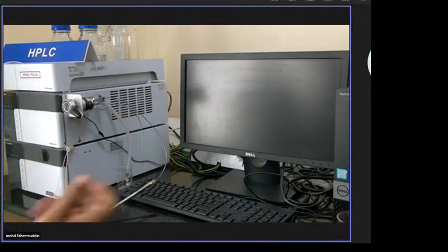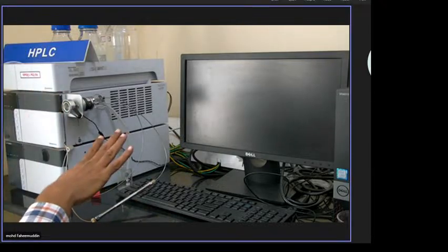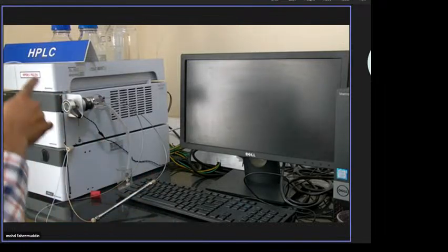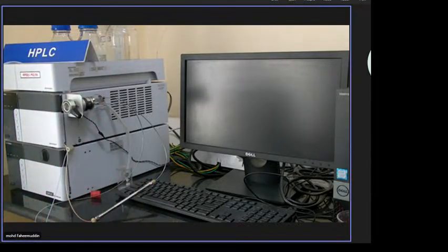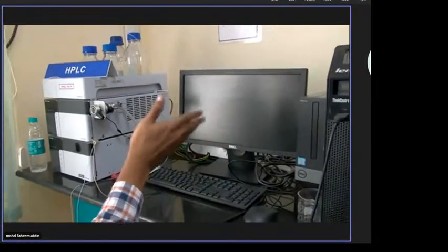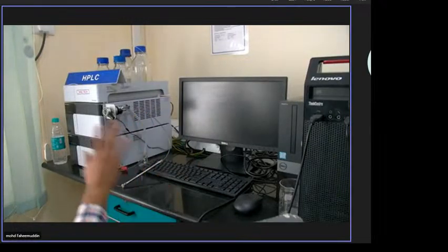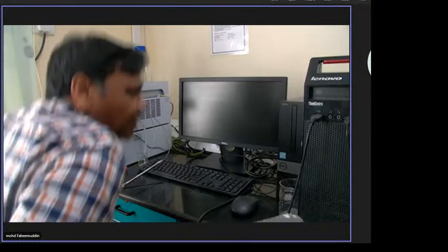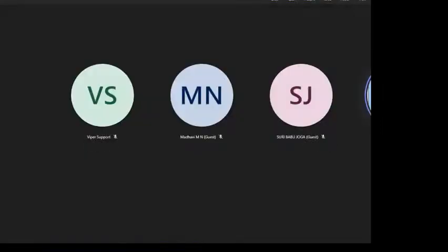When the samples are over, again one more tray. They will remove the tray and replace it. So they will not stop the instrument, they will not inject anything. The only thing is they are replacing the mobile phase, and that is also not manual, it is automatic. The chemist's duty is only to access the computer and take the data from the folder. You copy the folder and work on the data only. So the instrument keeps on running, same method, same parameters, nothing changes. Sometimes the instrument will not stop even for 1 year. It runs 24/7, stopping only during maintenance.